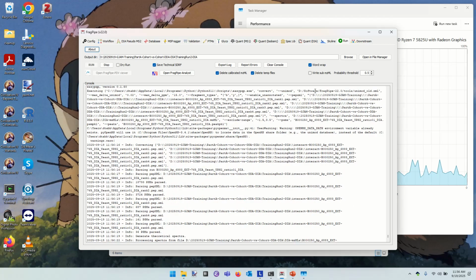And by just shooting the same sample lots of times, you will know that the actual variation is 0. So that's very helpful for making that kind of assessment. All right, it is finally grabbing all this stuff together to build us a spectral library. And we see that the CPU is jumping again.